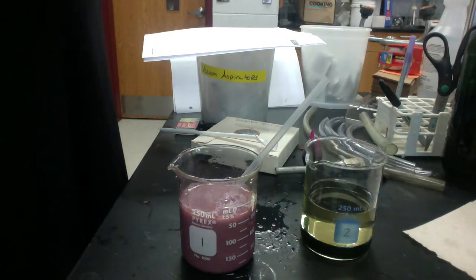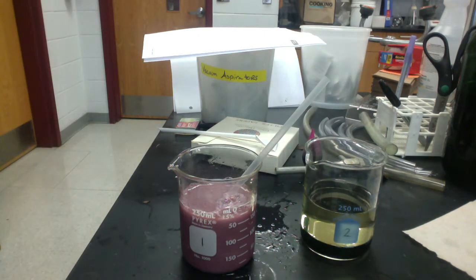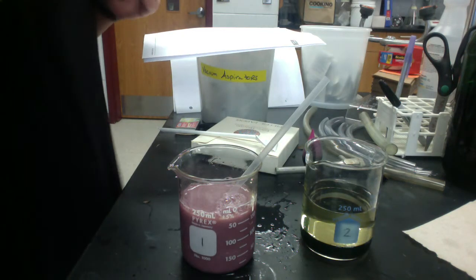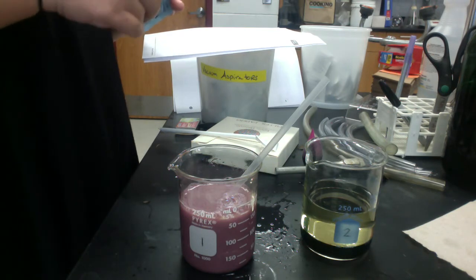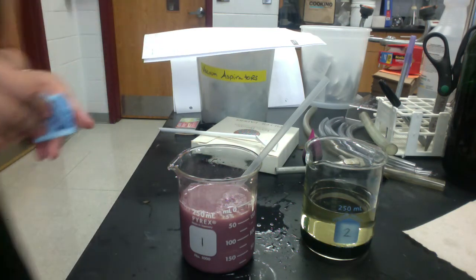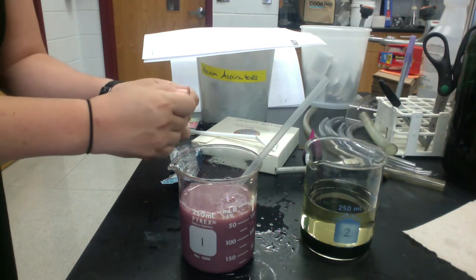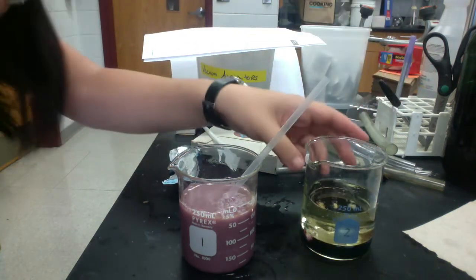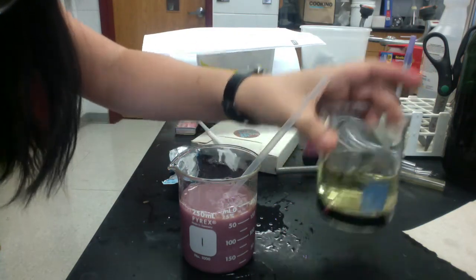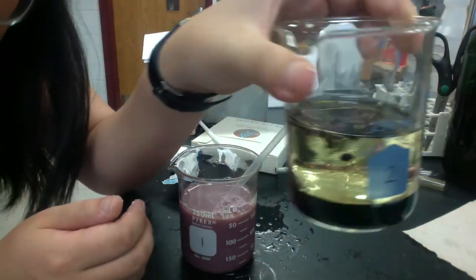Break the first antacid tab in half. Oh, I'm excited about this. Here's my antacid. Break the first antacid tab in half and drop 1/2 of it into beaker 2. Describe what you see. Oh, this is going to be fun, y'all. So I'm going to hold this up for you to see if you can see what happens.